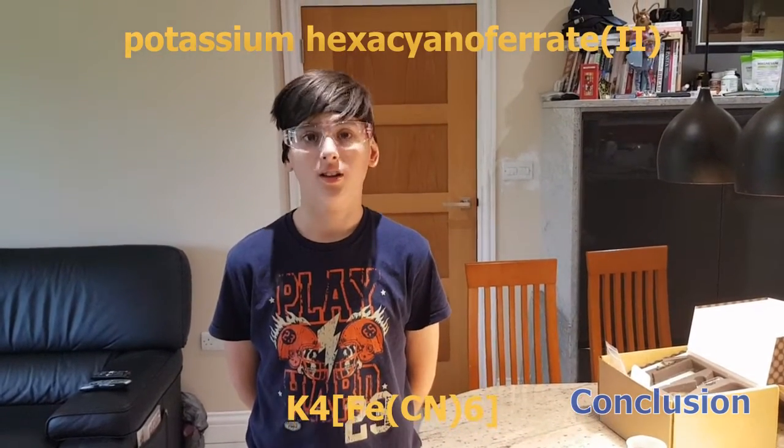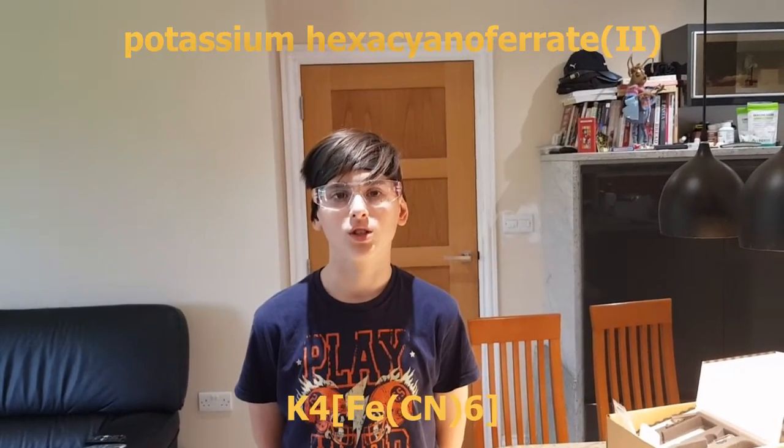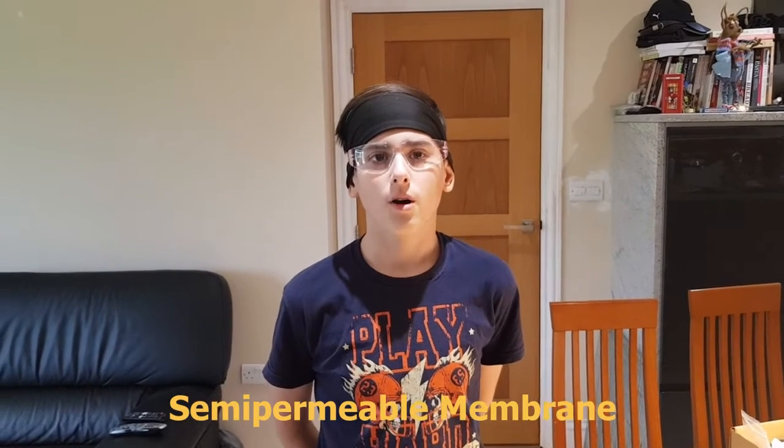The reaction between metal salts and potassium hexacyanoferrate results in a film created around the salt crystal. This film is made out of an insoluble substance. Water can pass through this insoluble substance, but it traps salt ions. This film is called a semi-permeable membrane, and the process of water going through it is called osmosis.